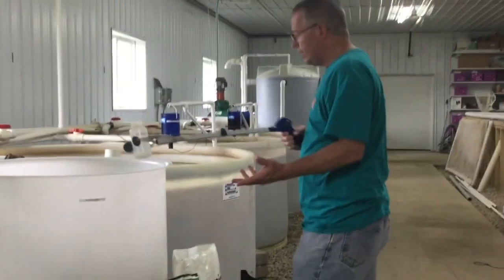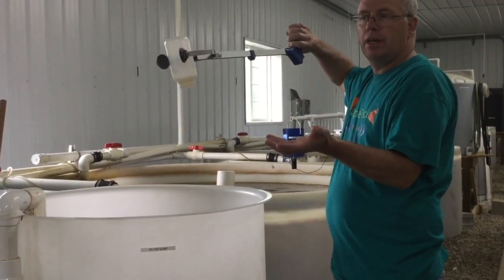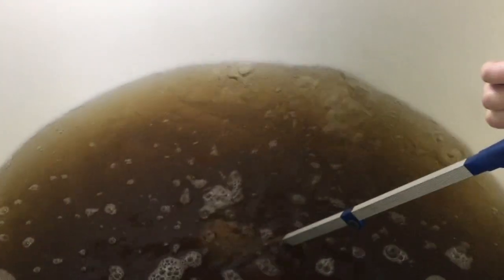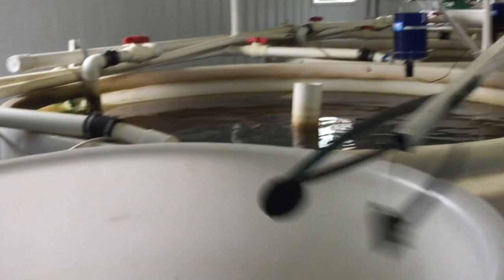You take a water sample — you don't want to get what might be floating on the top, as it might throw your sample off. So you tip the sample bottle over and take it down in the water, where it doesn't pick up water until you turn it back over. Then you fill from below the surface a little bit.